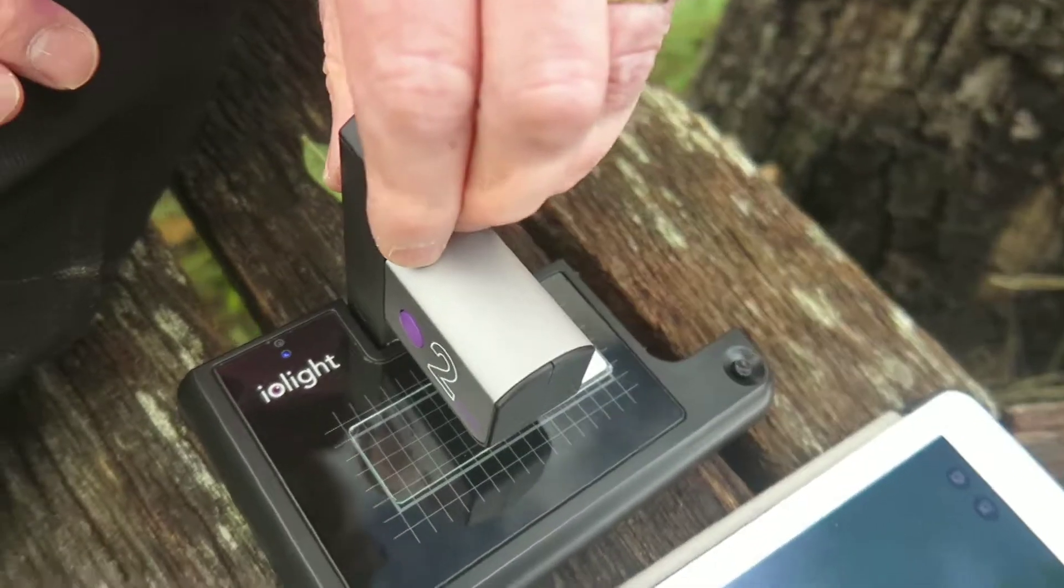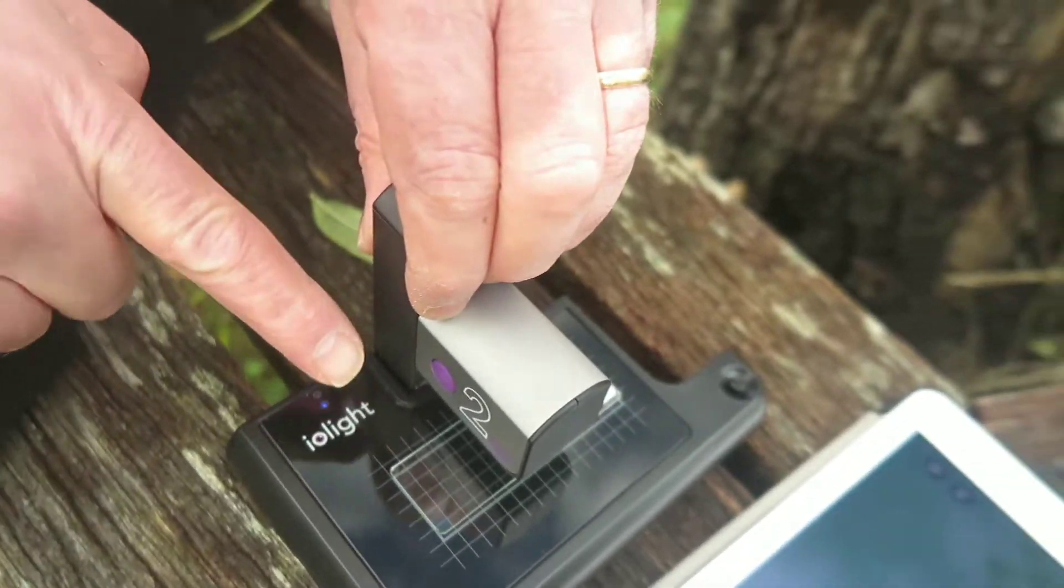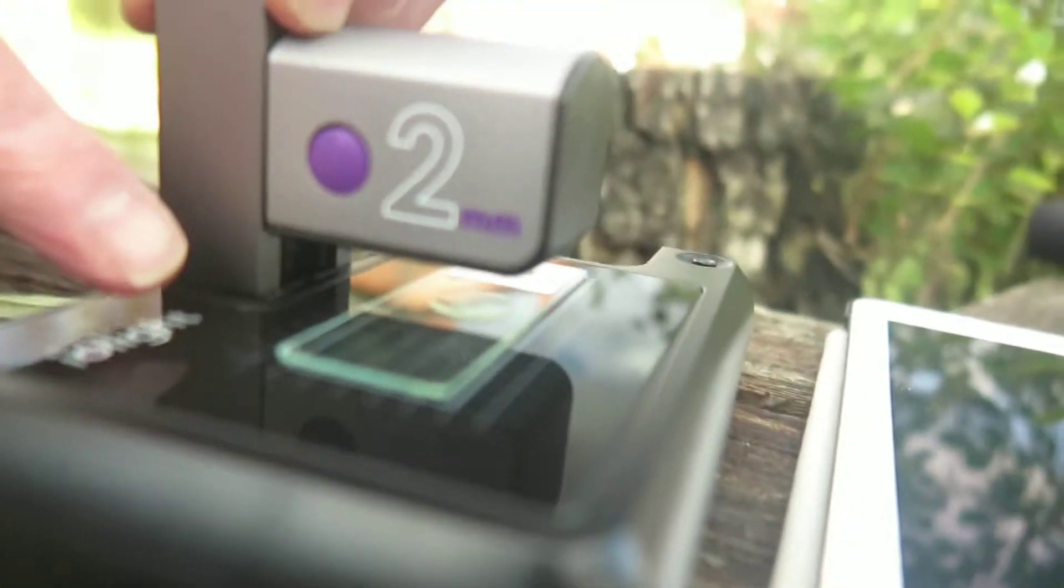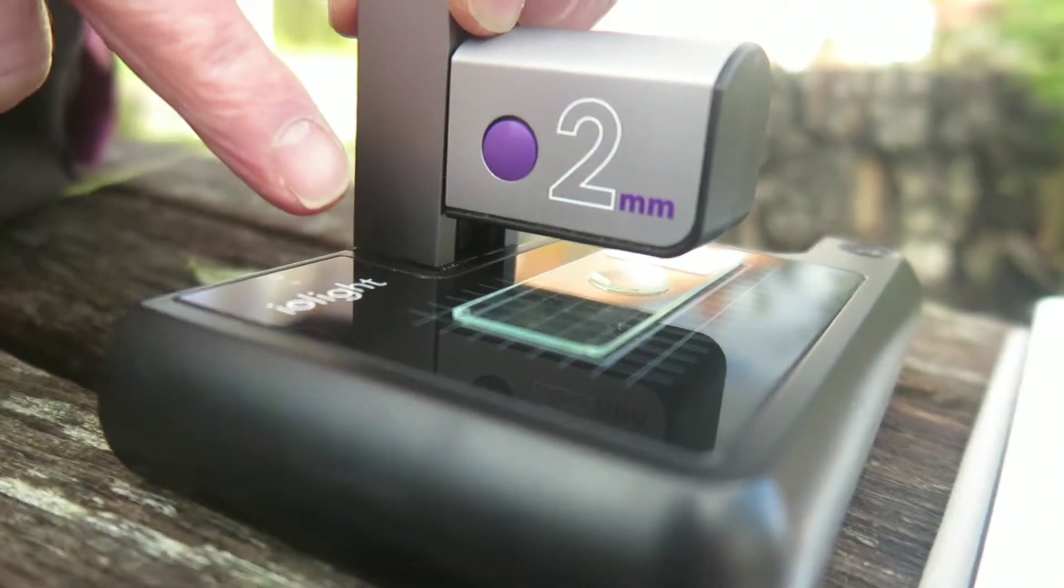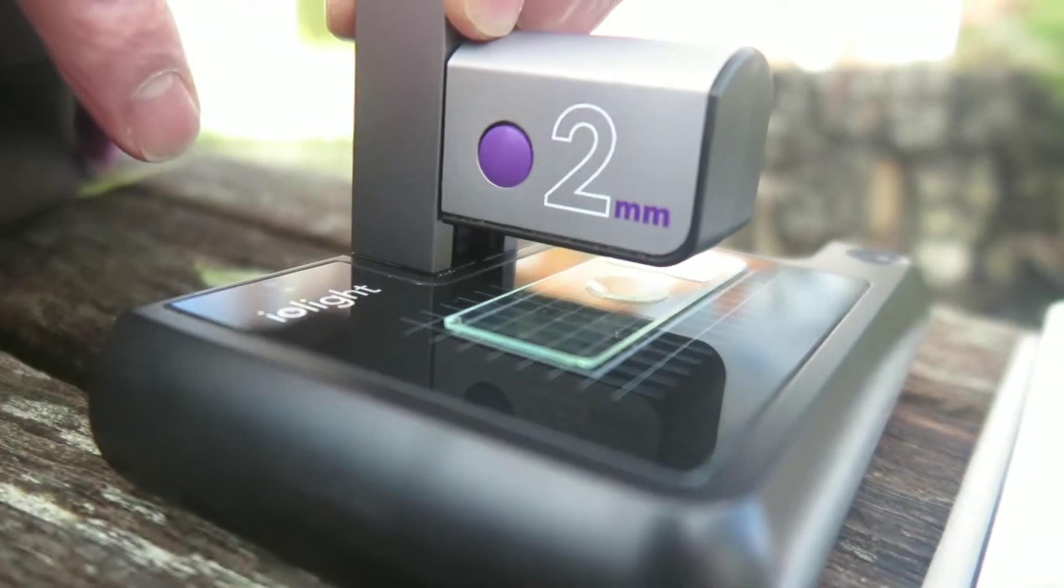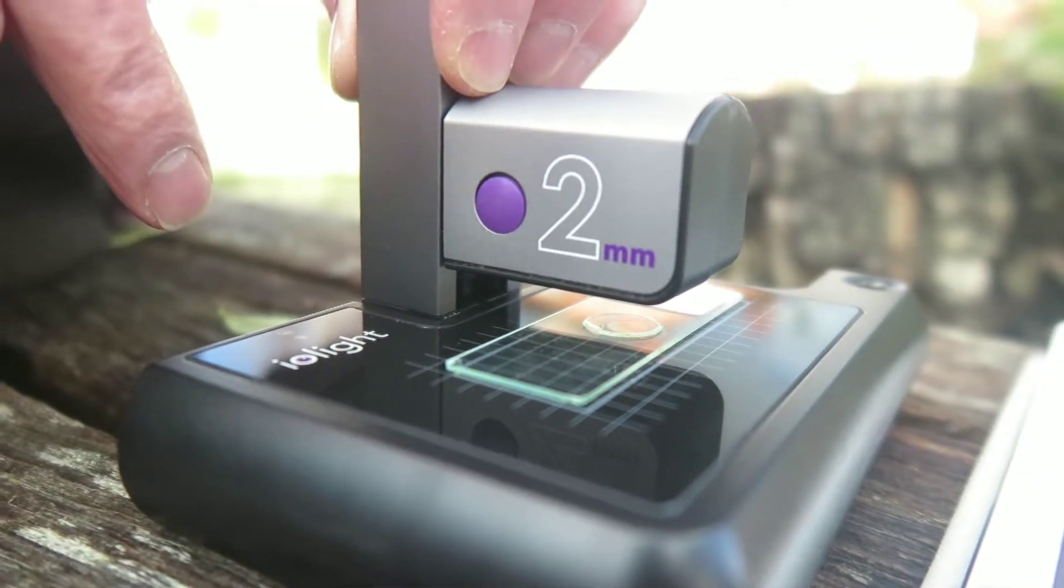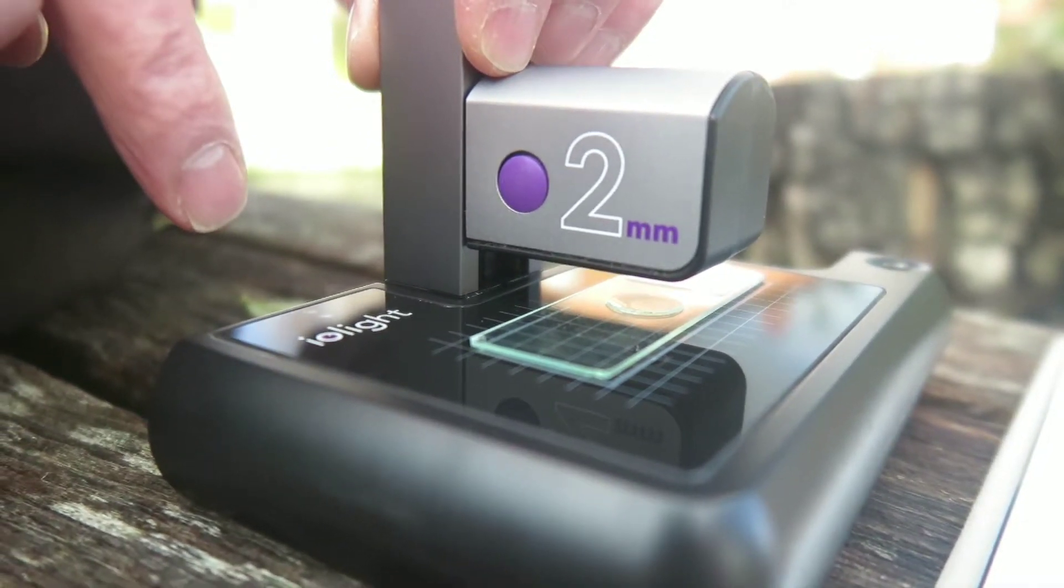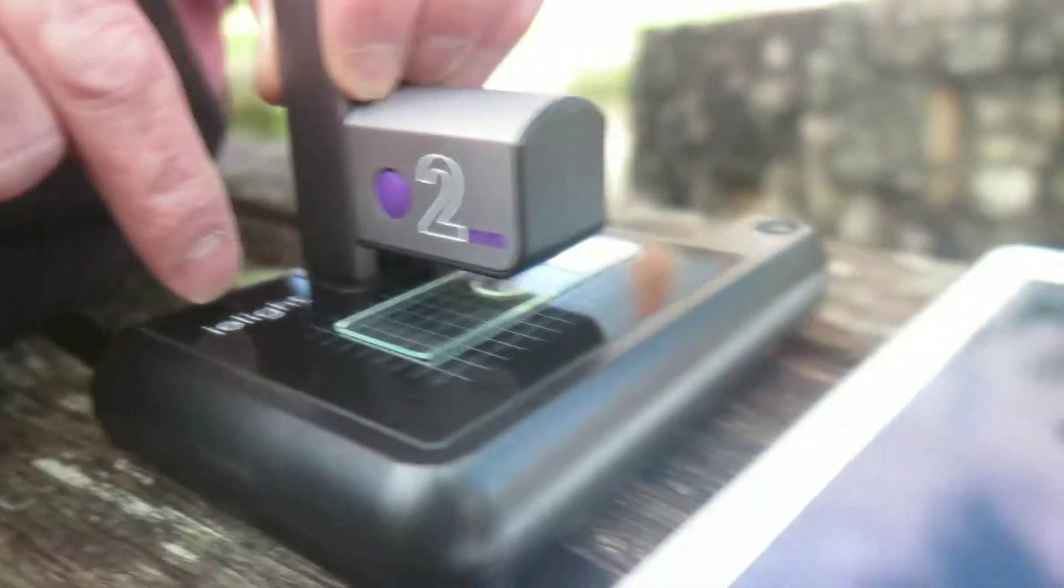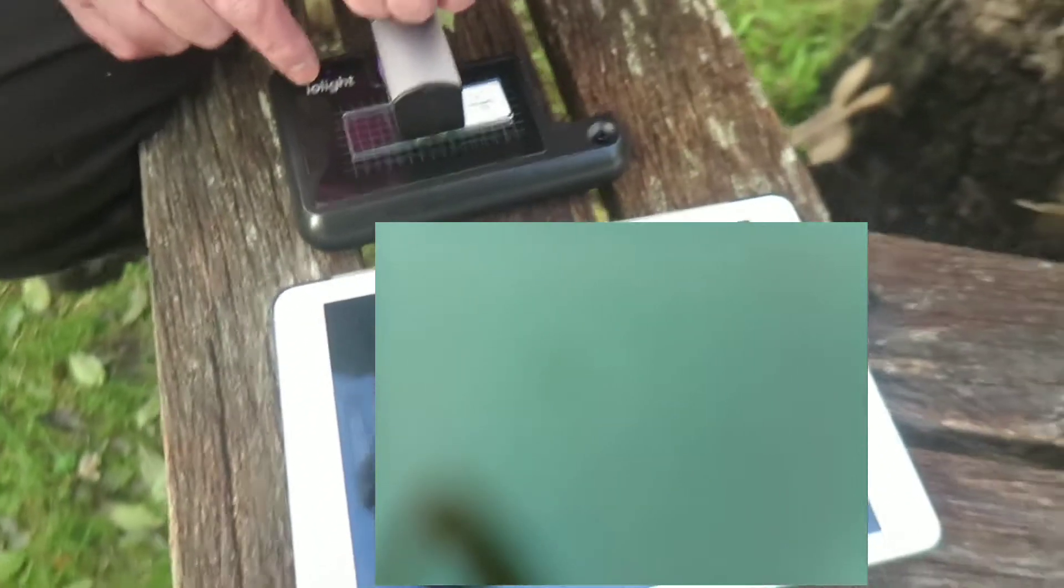So next to the mast like this and we're moving down towards the slide and this is a two millimeter microscope so we're looking for a working distance here of about 2.5 millimeters and on the one millimeter microscope that would be one millimeter. So now I'm just coming close to where I should be able to get an image on the iPad. And just by moving like that we've got something coming into focus.